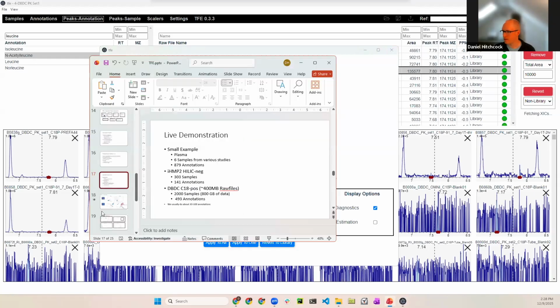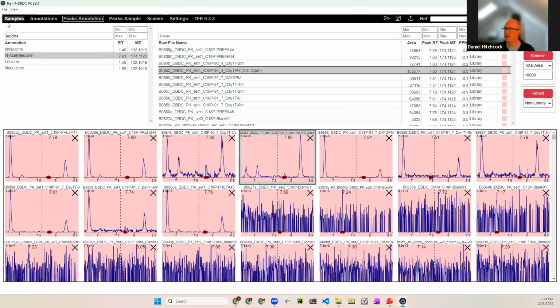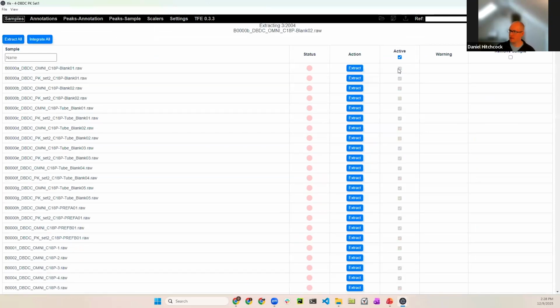Okay. Anyways, now strong plots. Okay, right. They're all red now, meaning they need to be re-extracted. And if I go here and click re-extract, it'll go through. This is a long process, obviously.